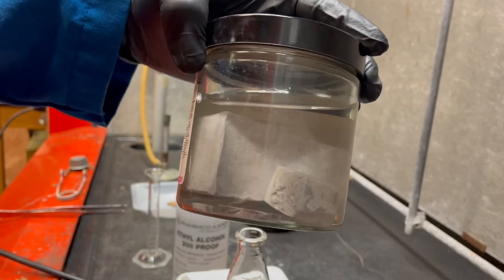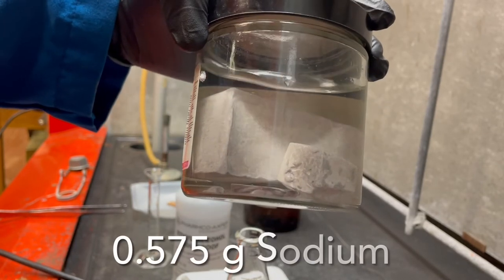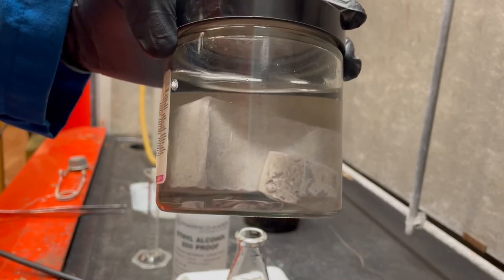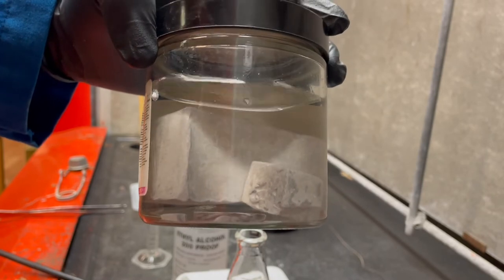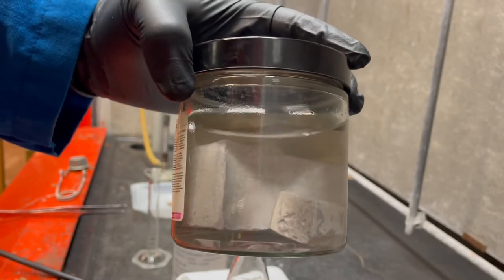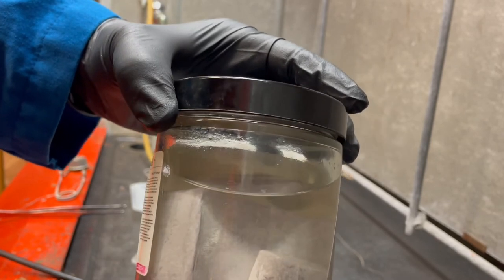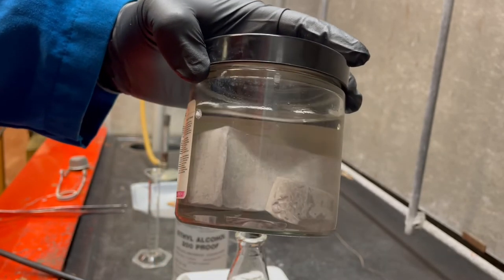Just a bunch of small pieces that equate to about 0.575 grams. Then I'm going to add that to the 10 mils of ethanol. I'm going to stir that up for a little bit of time, till it dissolves, really. And then that should give us our little batch of sodium ethoxide.